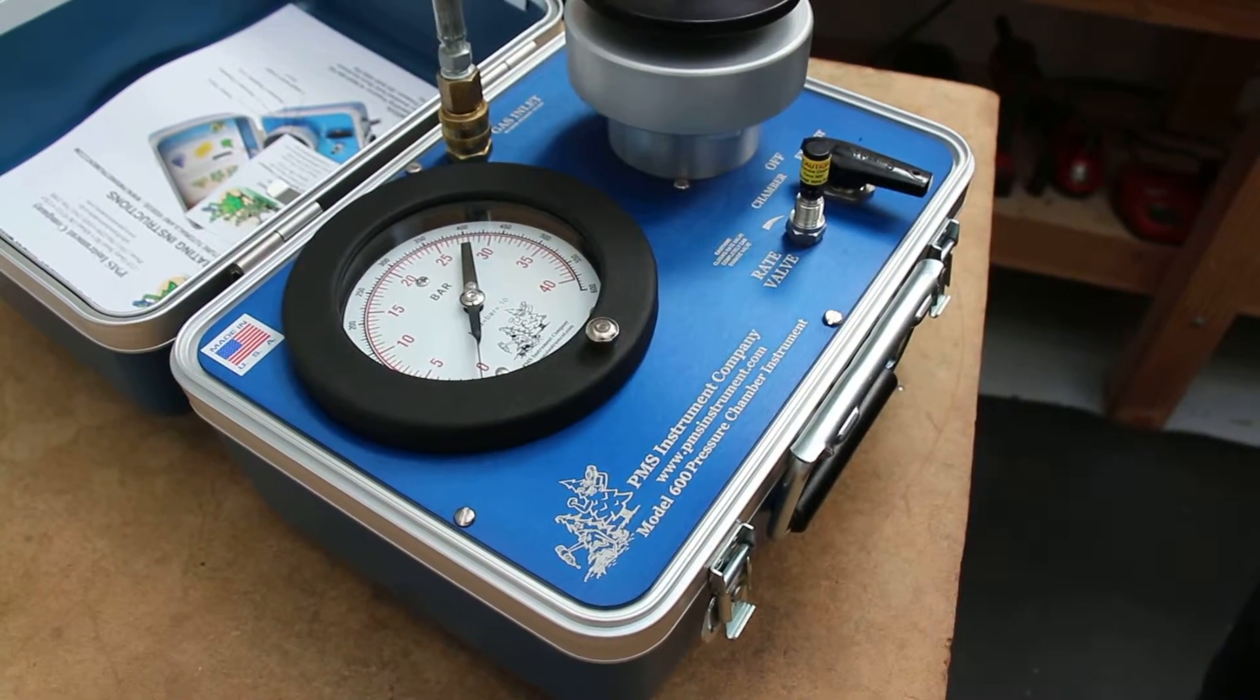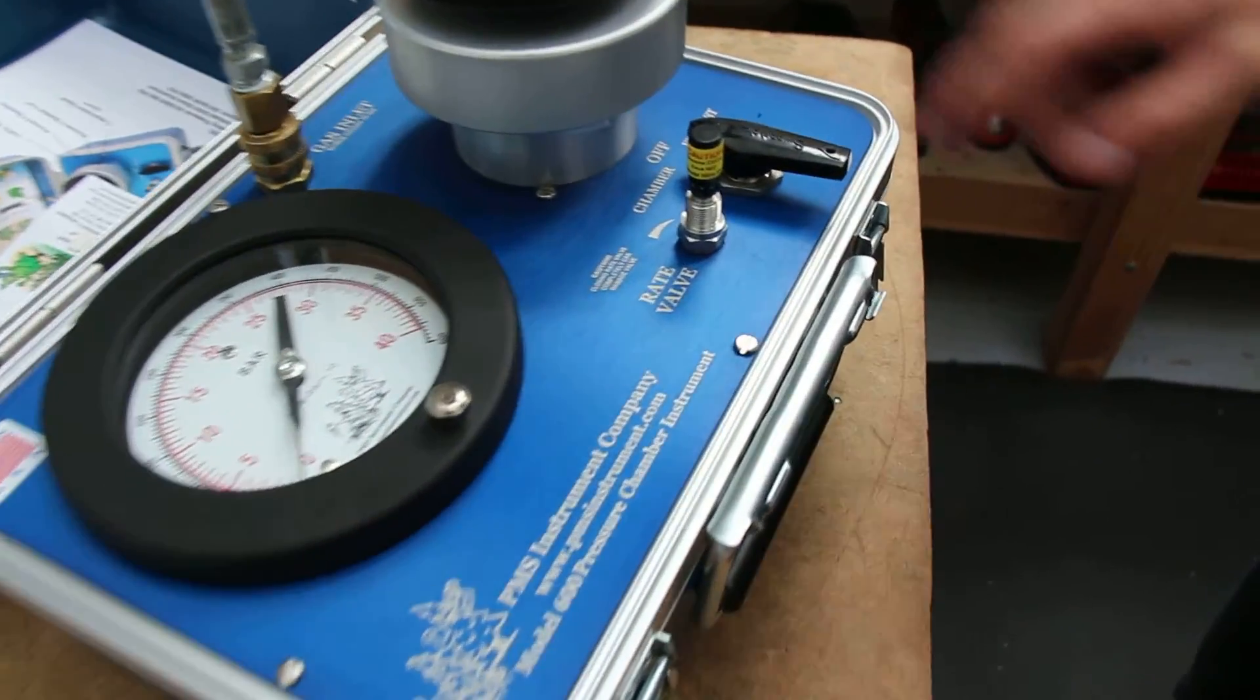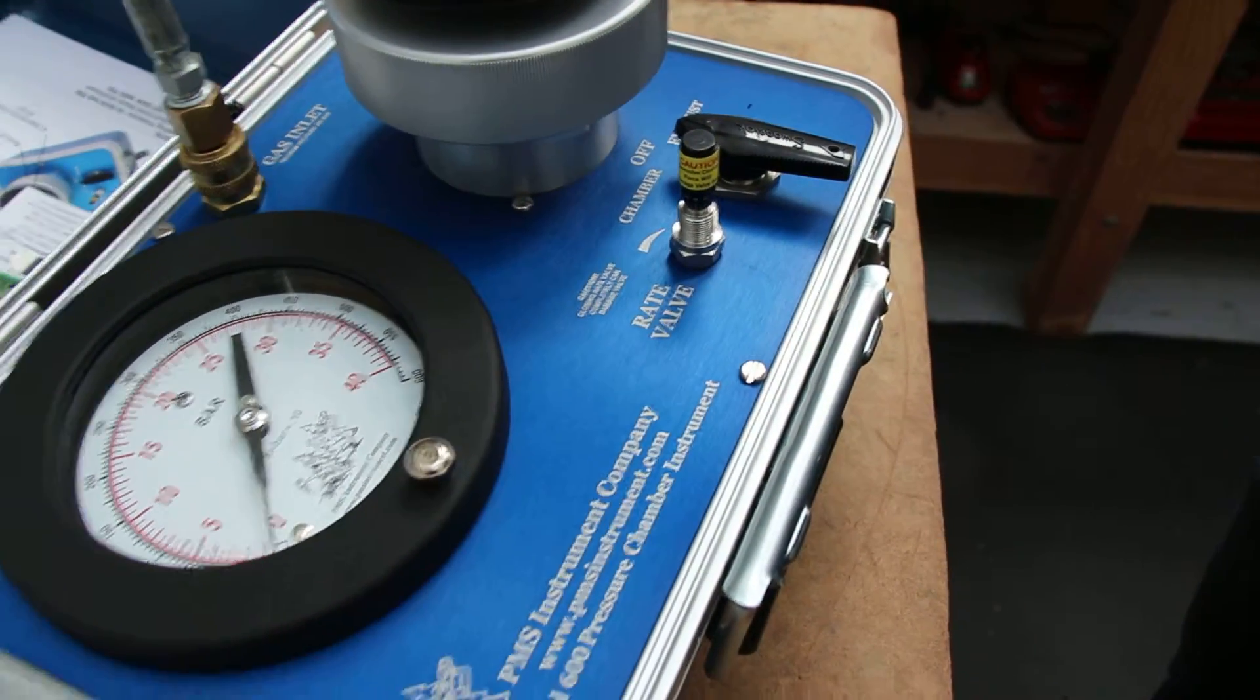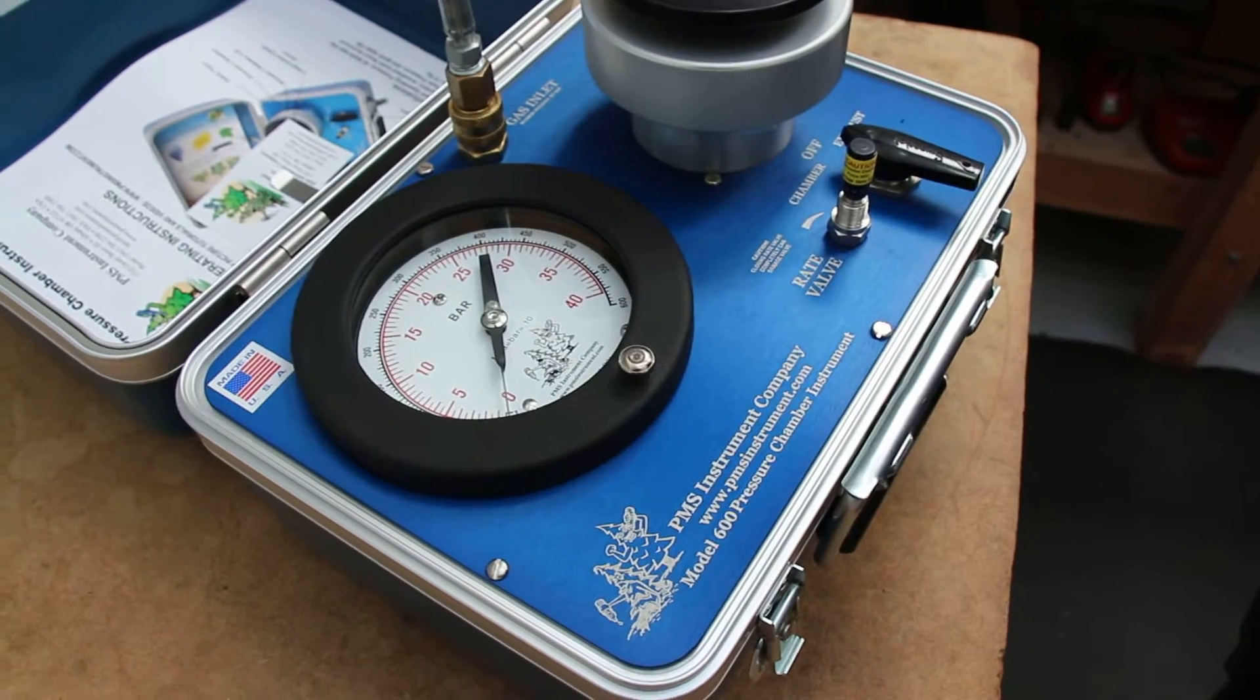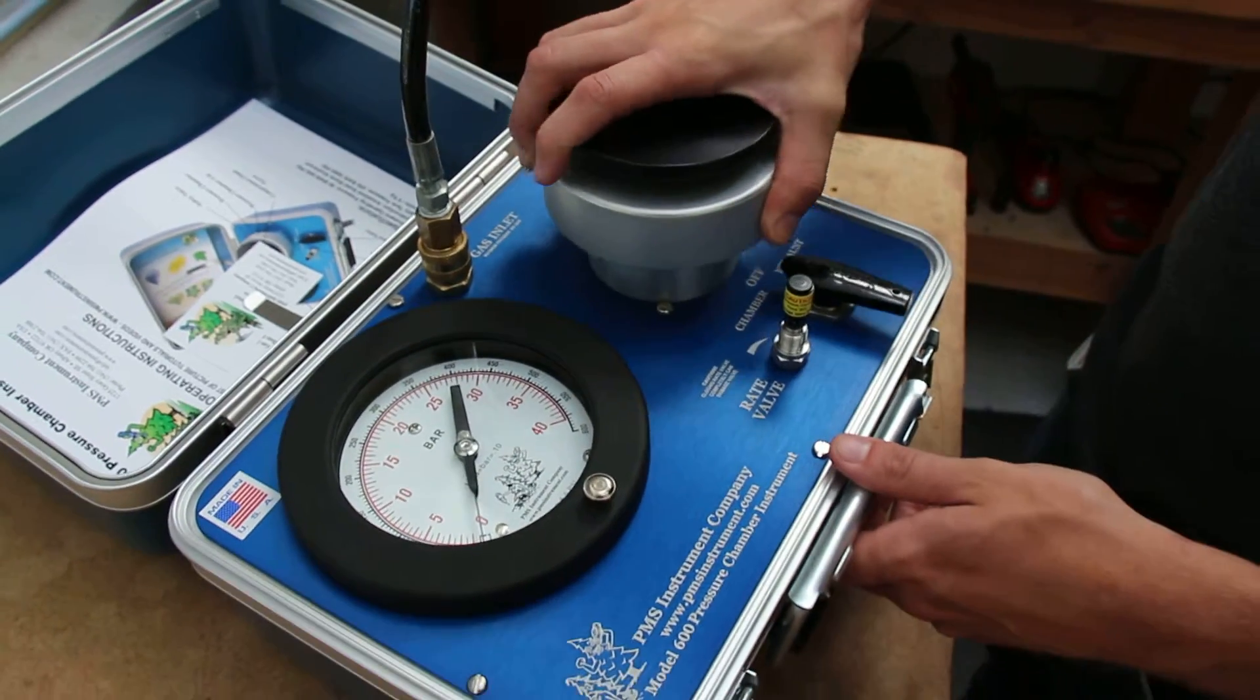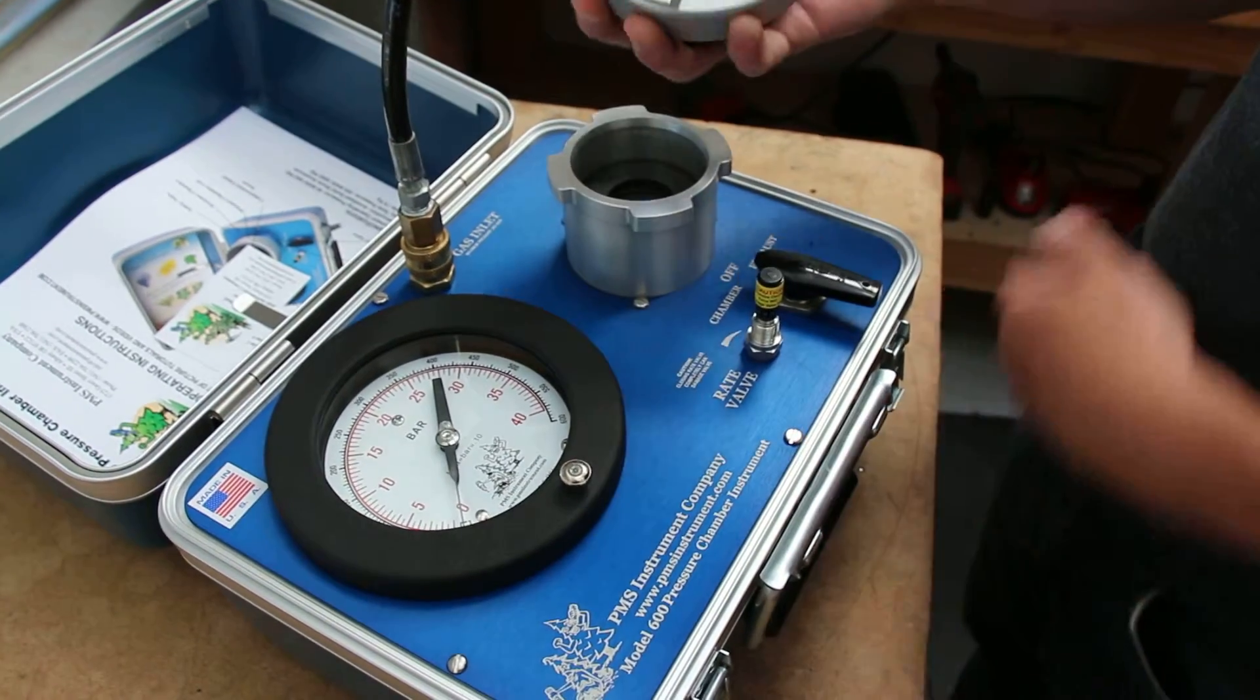This tutorial shows how to adjust the rate valve at a rate sufficient for taking water potential readings for agricultural purposes. First, we're going to open the chamber and plug up the chamber so that it's sealed.